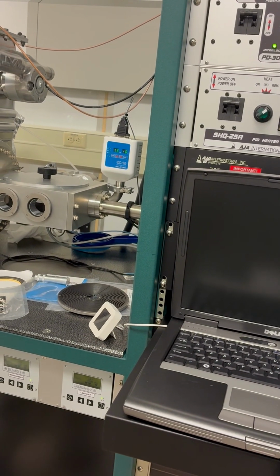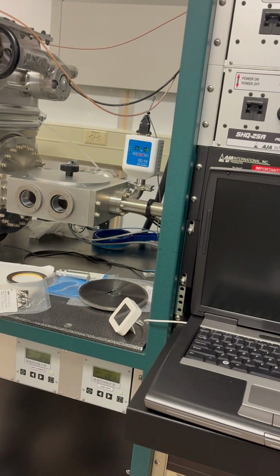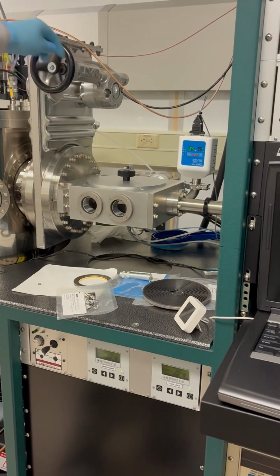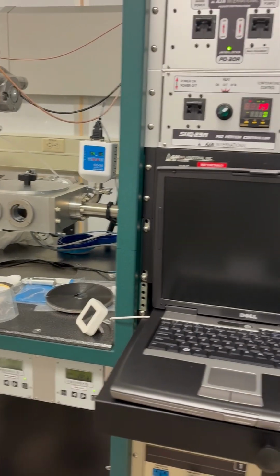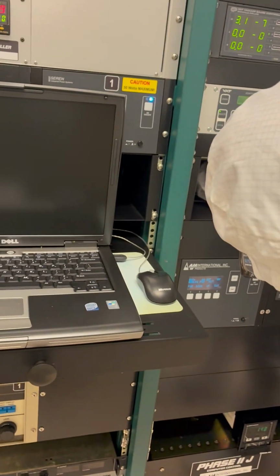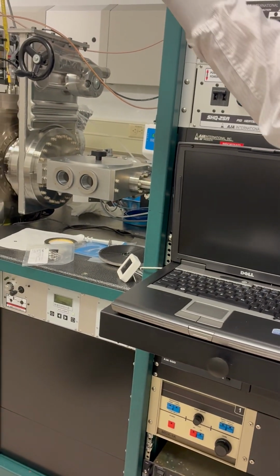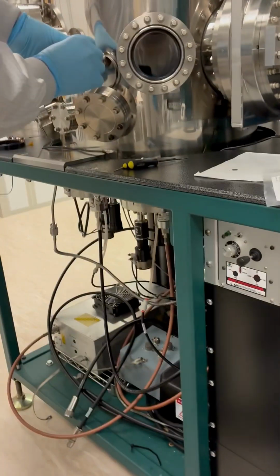I'm going to open this up. I'm going to push the transfer arm in, and I'm feeling for any crashes. Maybe I didn't put that at the right height. Maybe I left the QCO in the way. Any of these sorts of things could happen. Right, and I'm going to open the shutter so I can see what's going on.